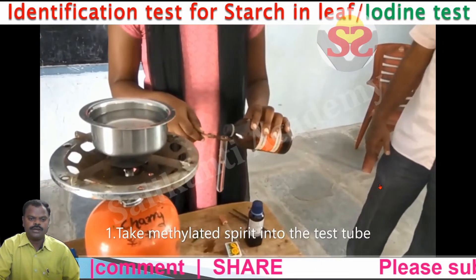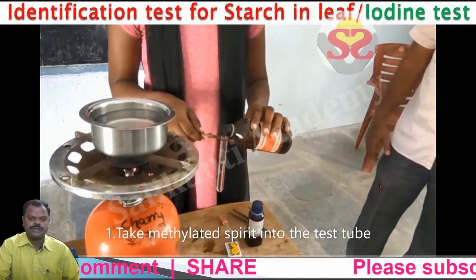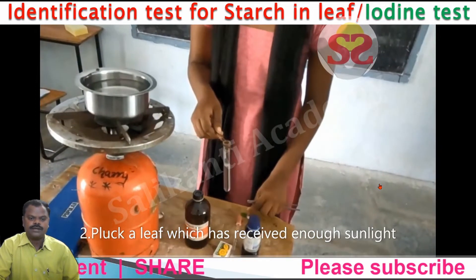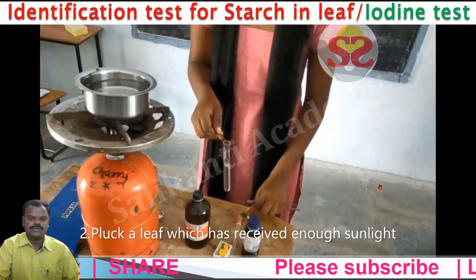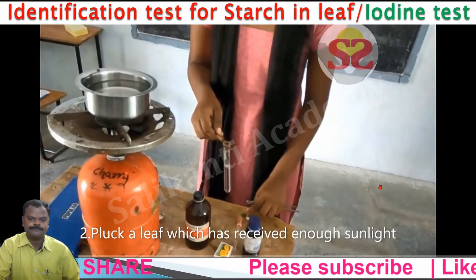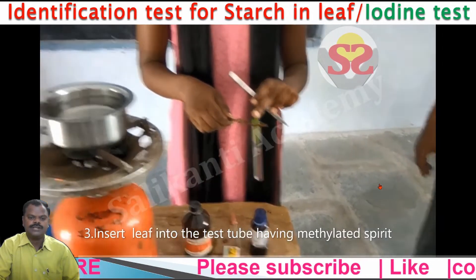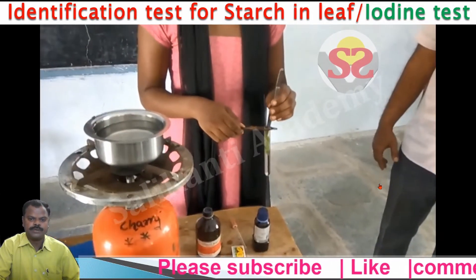First, we take methylated spirit into the test tube. Collect a leaf which has received enough sunlight, then insert the leaf into the test tube having methylated spirit.